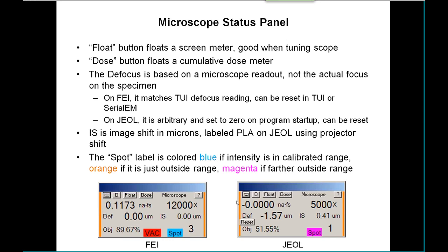The microscope status panel has a couple of cryptic buttons. The float button will take this screen meter and float it on a separate little window that you can position right next to where you're looking while you're tuning the microscope. The dose button floats another little window that shows a cumulative dose.